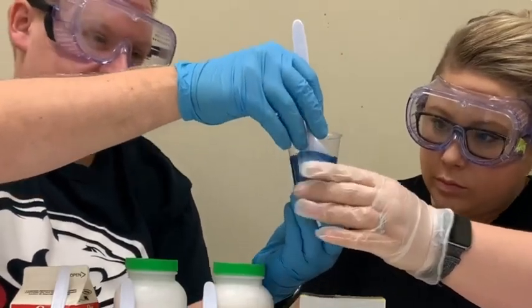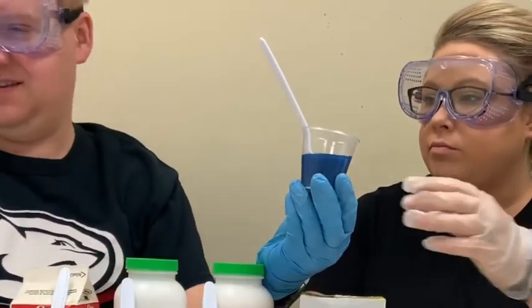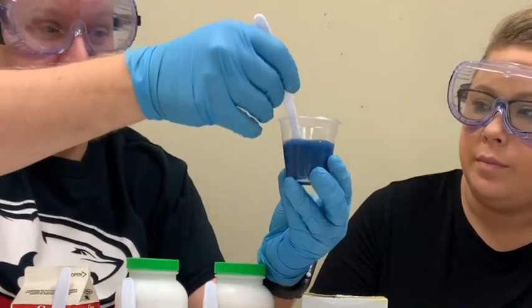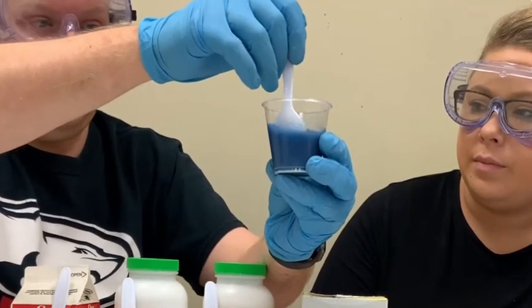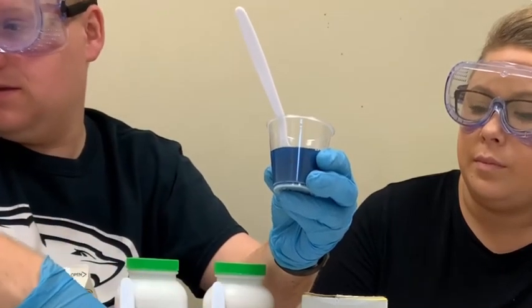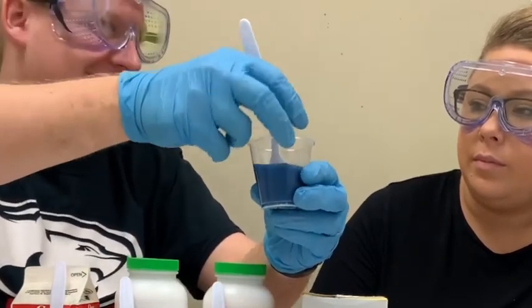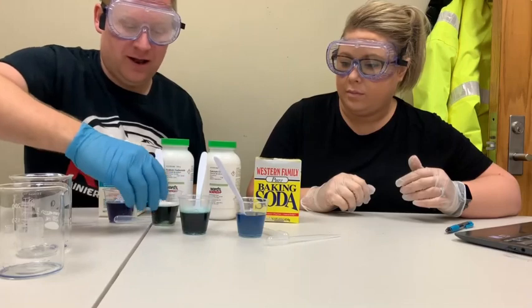This one definitely feels like it's getting colder, but we're going to give it a second. Okay. It turned blue. I do not see any gas being produced, and I do not see any precipitate at the bottom. And then we have a temperature change, and it is definitely getting colder, despite what my answer key says. Without a doubt, it is much colder in comparison to these ones that got warmer already.